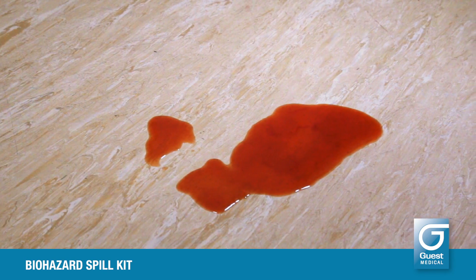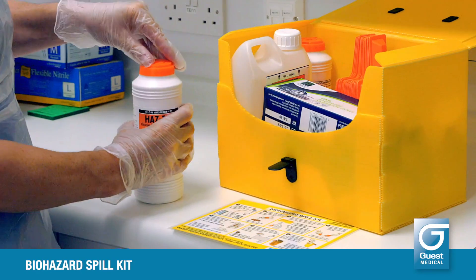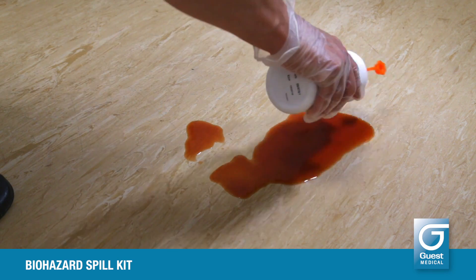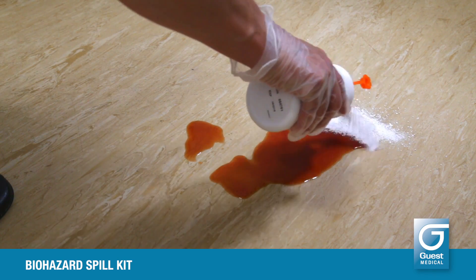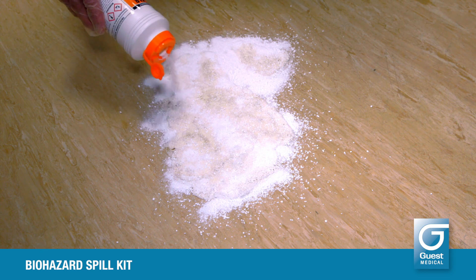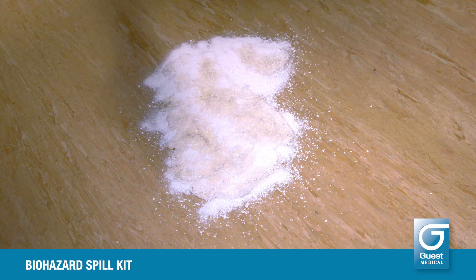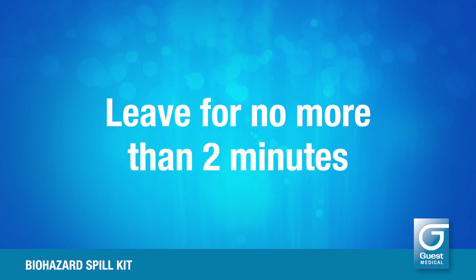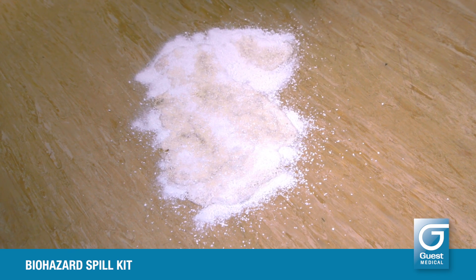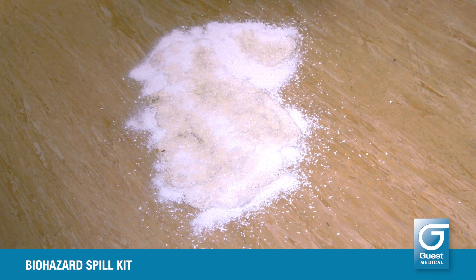For spills on relatively flat surfaces, sprinkle the HAZTAP granules over the spill until all the moisture is completely absorbed. Do not leave the granules moist or damp. Leave for no more than two minutes. The spill will now be properly disinfected with 10,000 parts per million available chlorine.